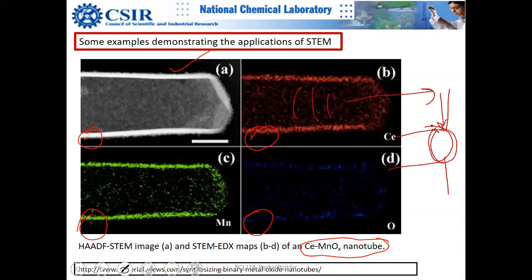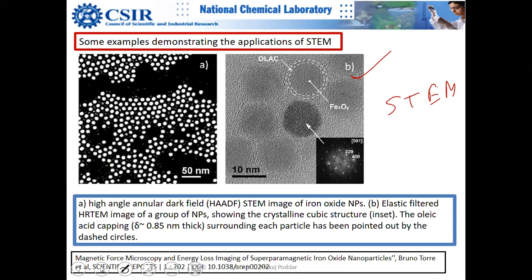When you're bombarding here, they are crossing two layers, actually in the middle also. So this is actually two layer data, and this is actually much thicker data, because here at the periphery you have more path length for the electron. Just think about it. If you think, you will know what I mean.